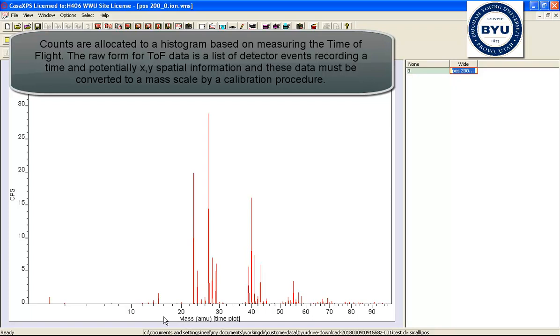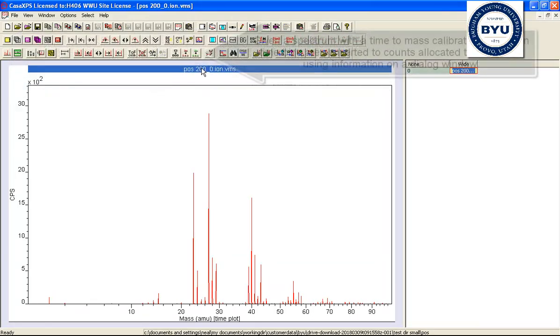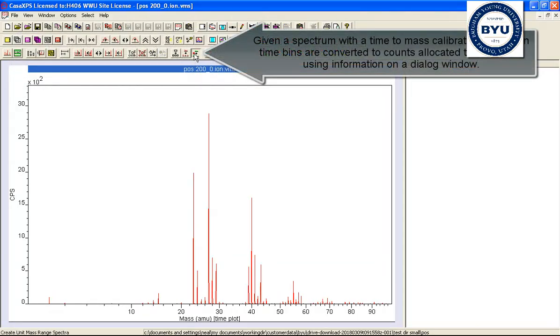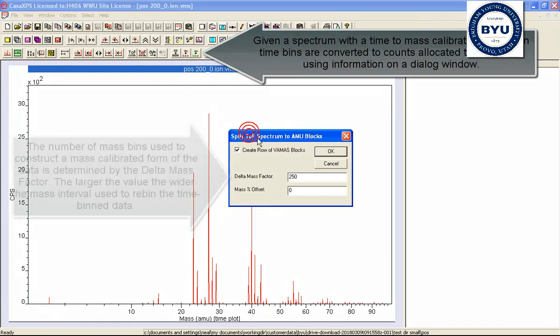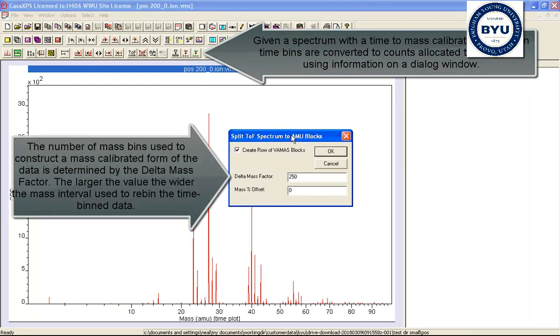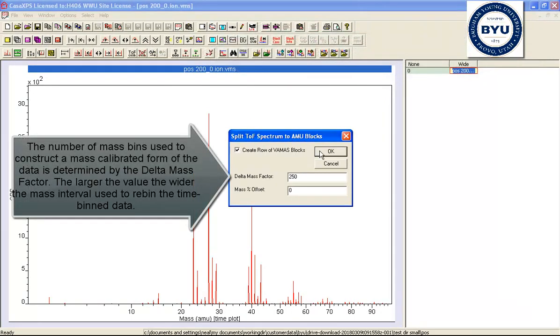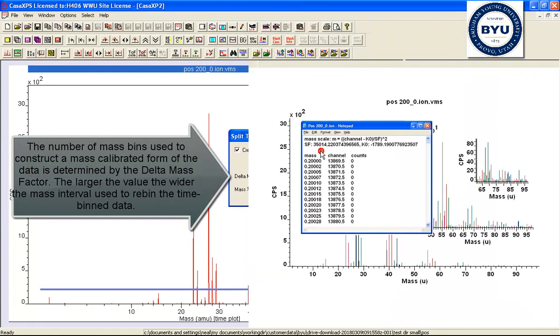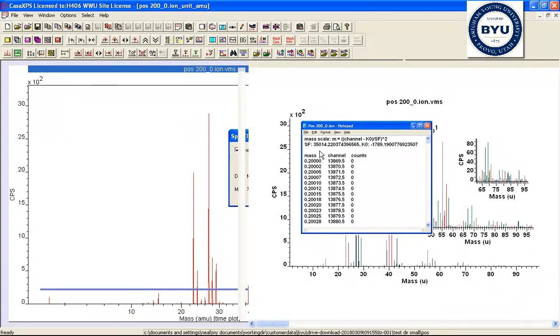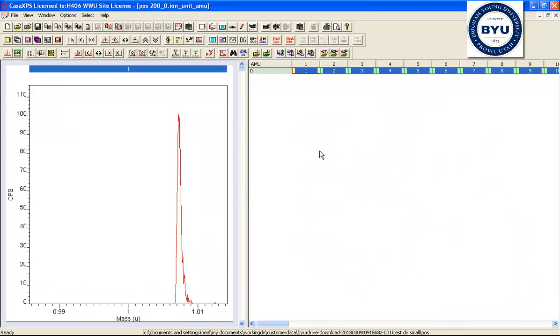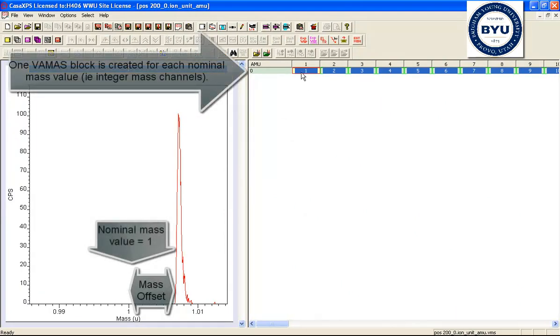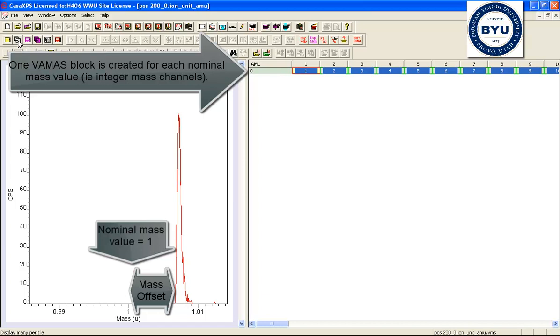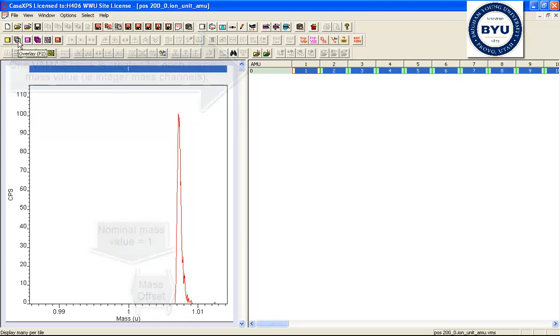Hence you see a non-linear scale here when in a time plot. We can, however, convert a time plot to a mass plot using the split-TOF spectrum into AMU blocks. What this does is it converts the time spectrum and re-bins the data according to a set of VAMAS blocks that are associated with the unit mass.